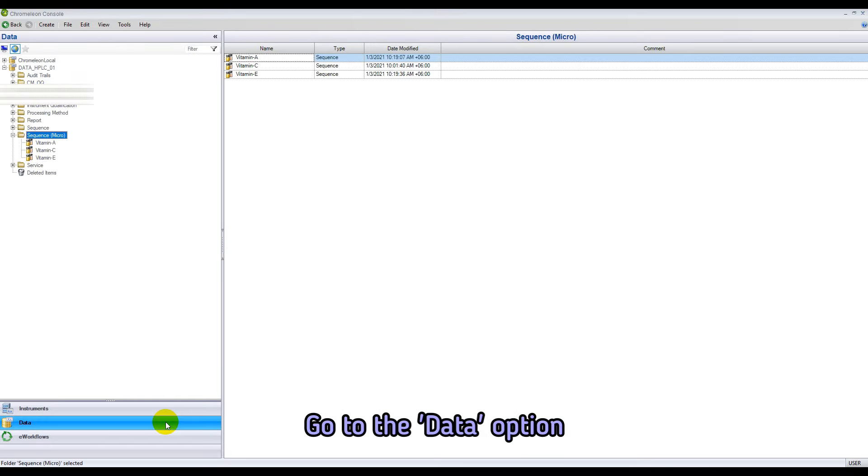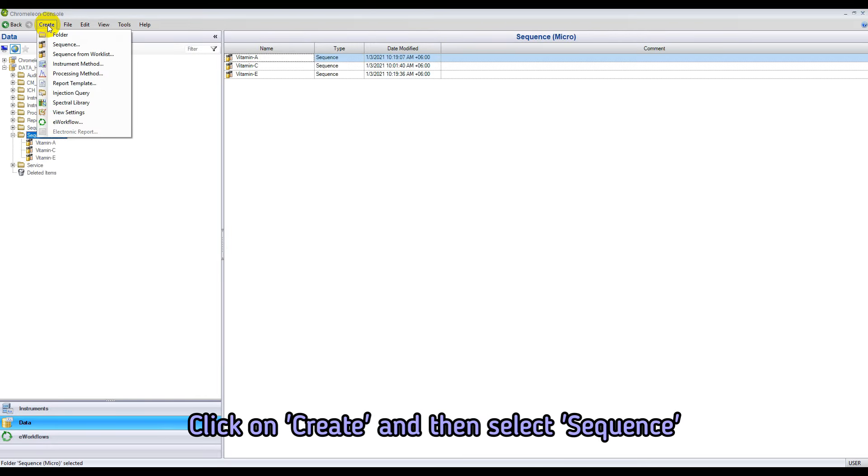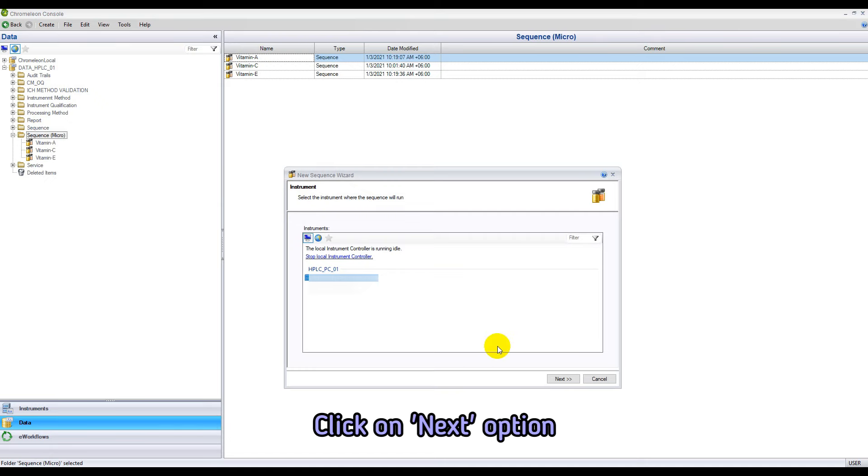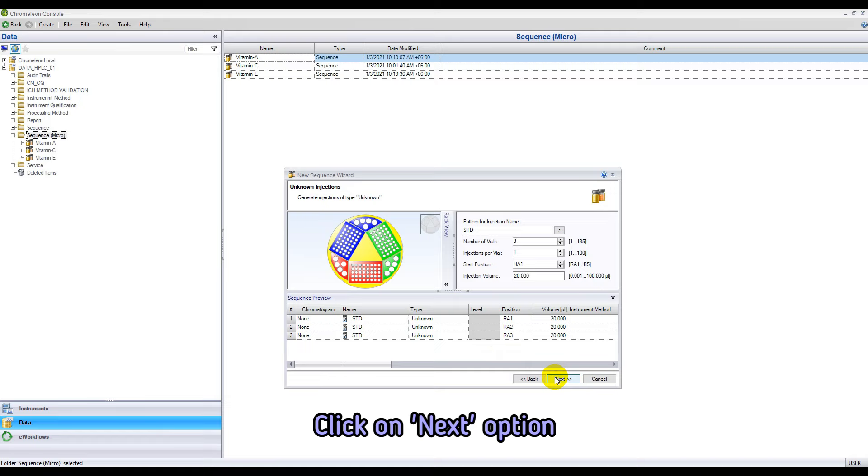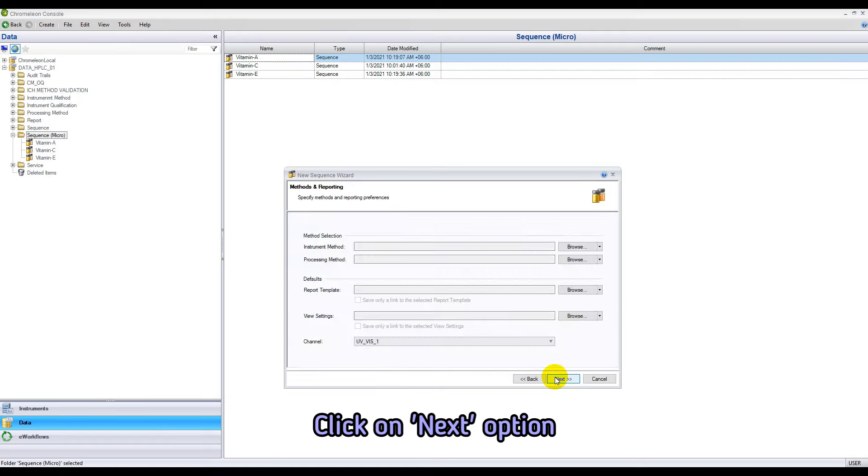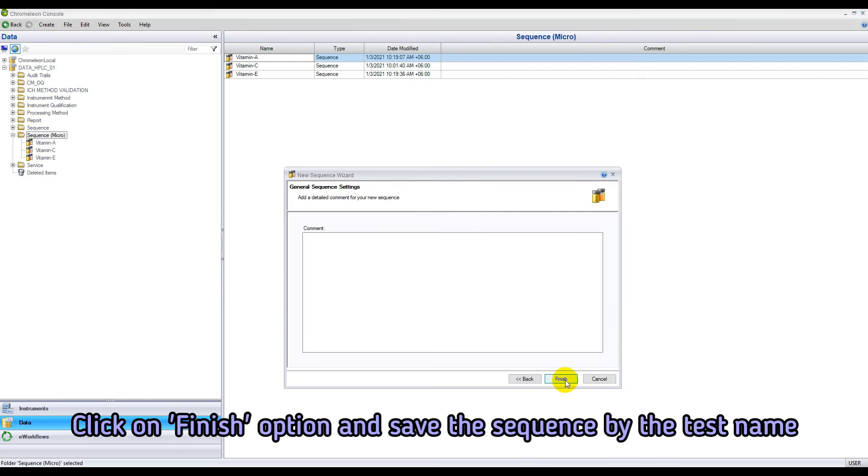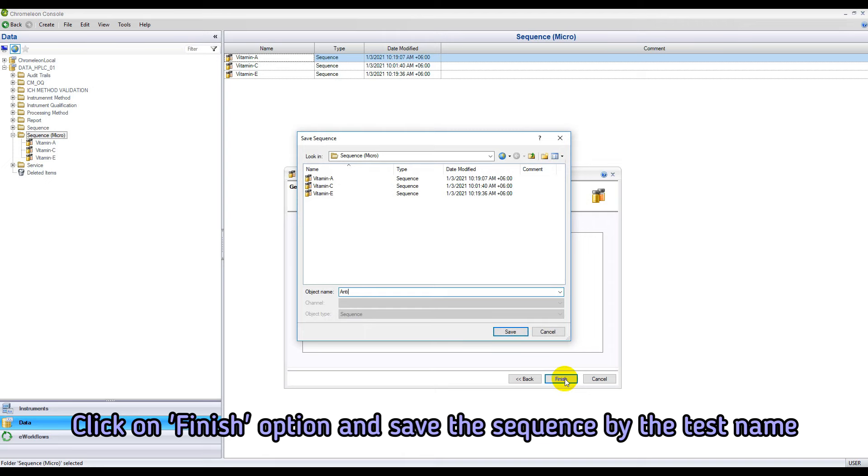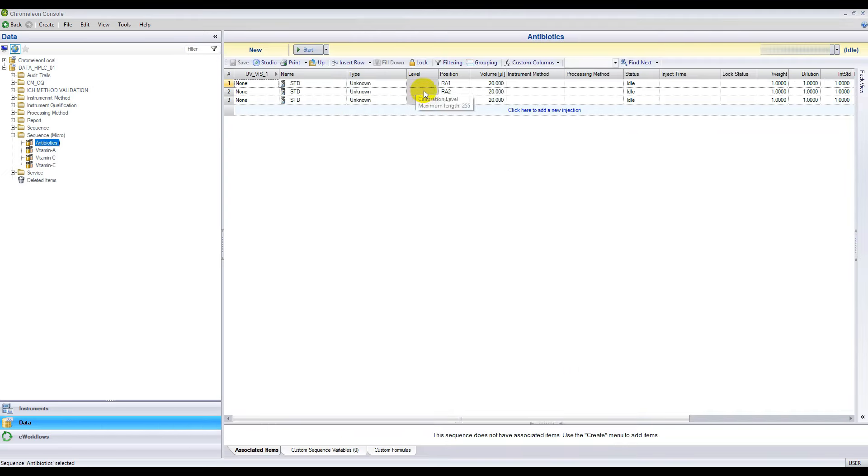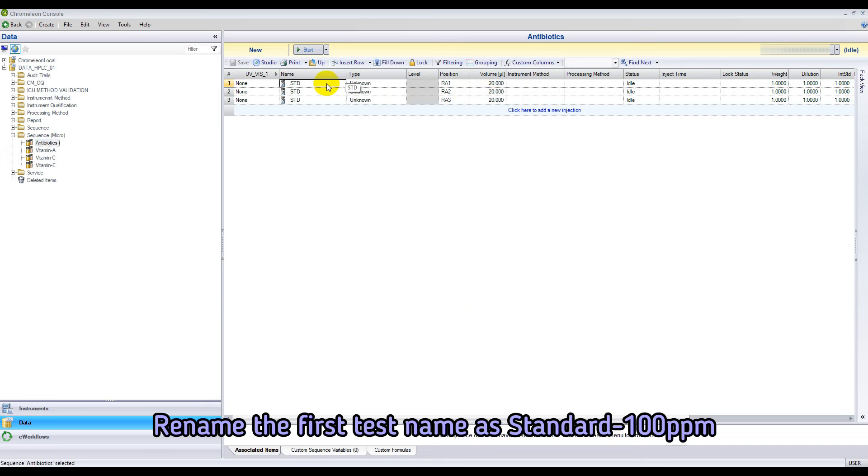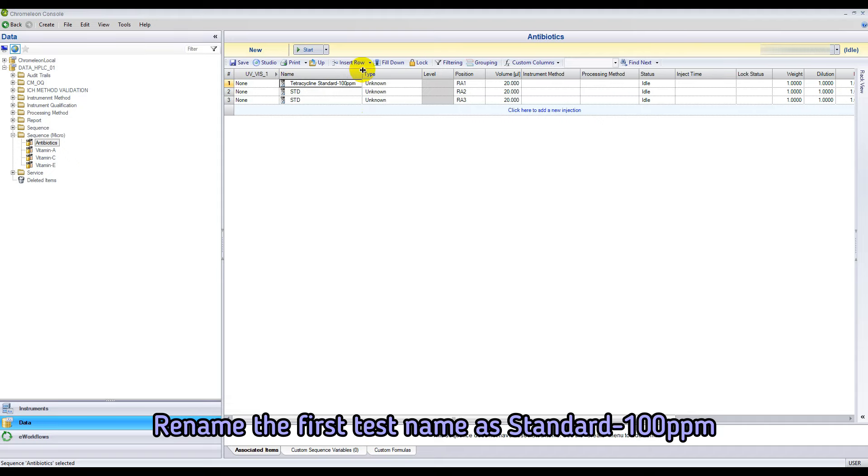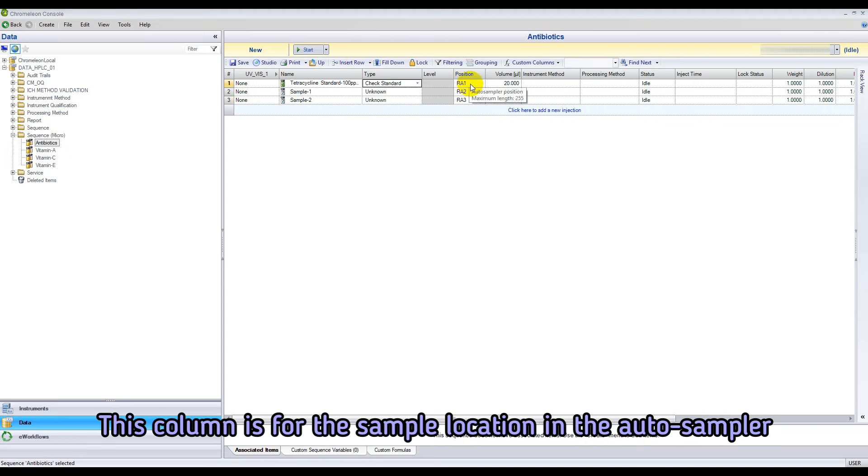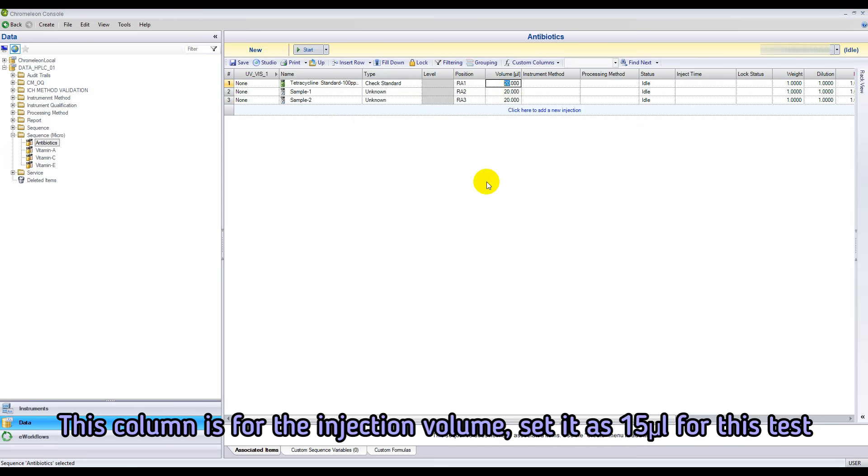Go to data option. Create a sequence. Save the sequence by the test name. Rename the first test name as standard 100 ppm. Rename the second and third test name as sample 1 and 2. Set the vial position in the auto sampler if needed. Set the injection volume at 15 microliter.